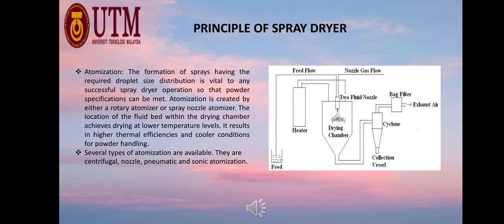My name is Sanga Emmanuel and I'll be presenting on the working principle and the experimental plan for experiment 4, which is a spray dryer. So the main working principle for the spray dryer is the principle of atomization.